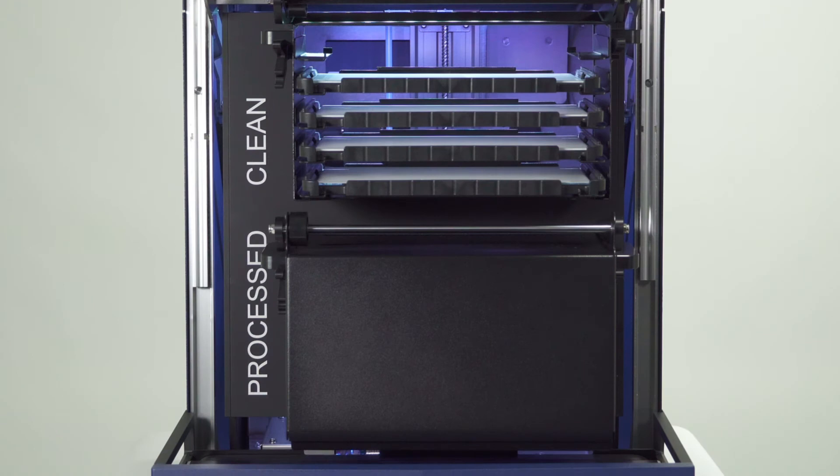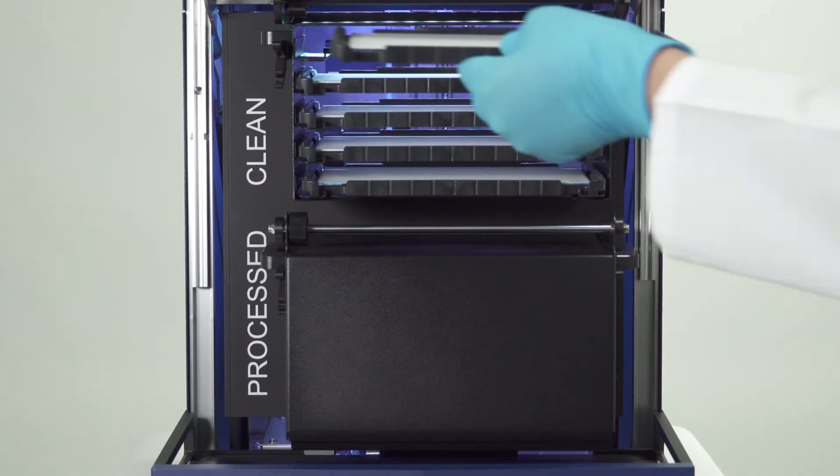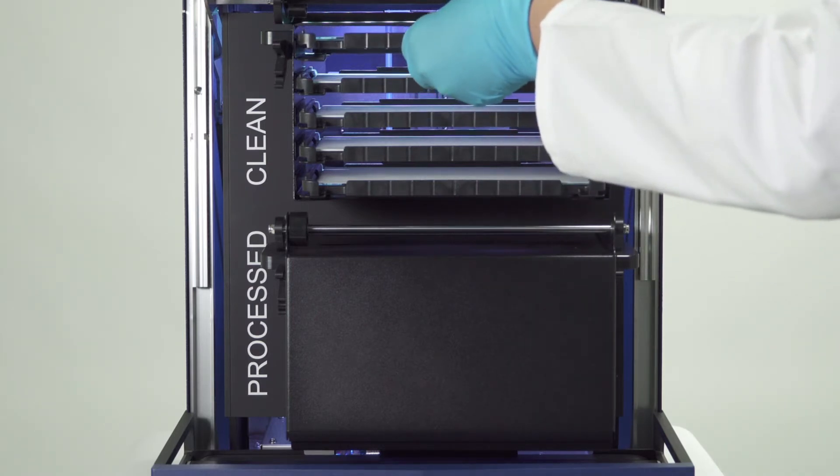The HPTLC Pro module plate storage contains two separate plate stackers: one dedicated to clean plates, and the second one for already processed plates. Equip the module plate storage with up to five clean HPTLC glass plates.